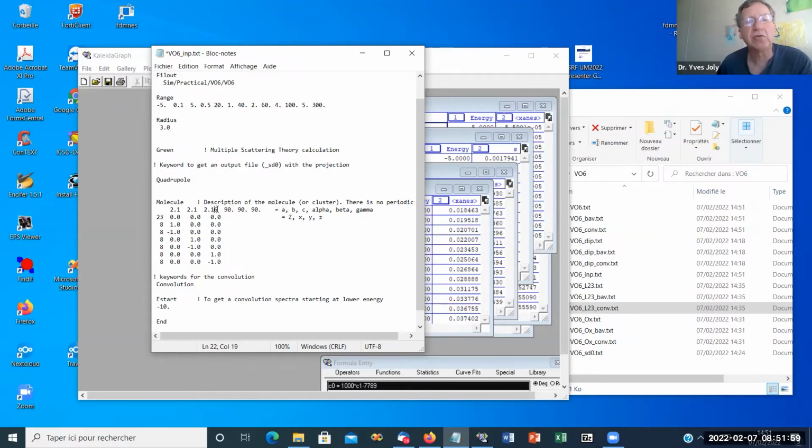It's more or less 3%. It's not to be precise. So I write just to remember. We save, and we run again.